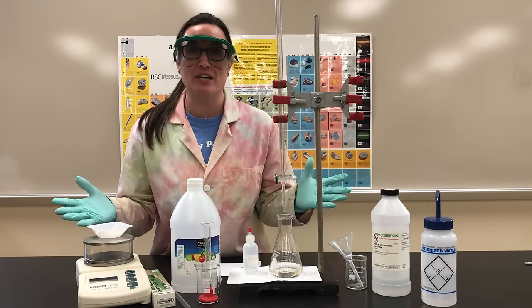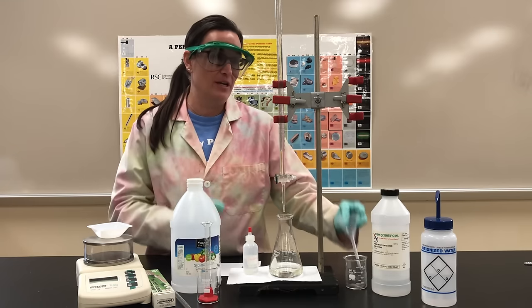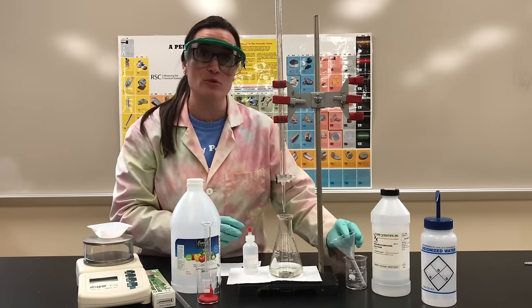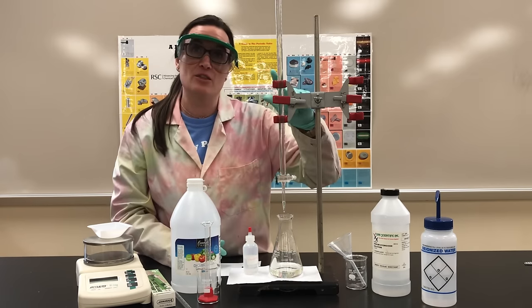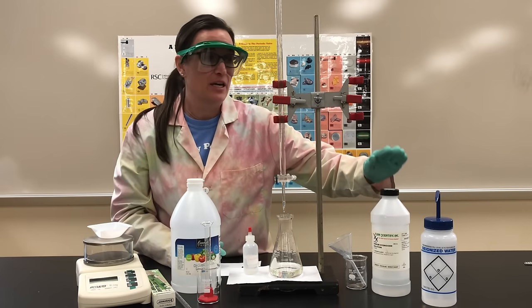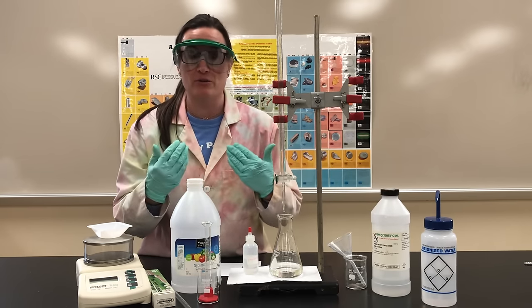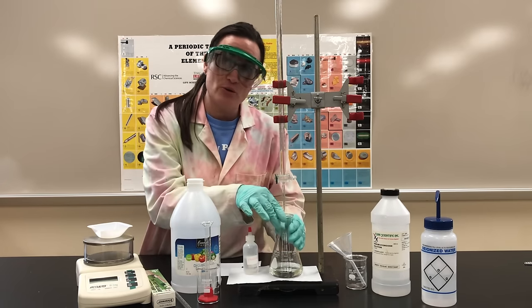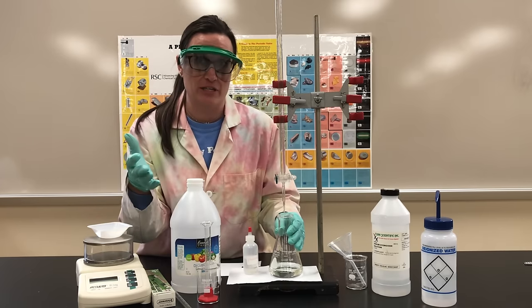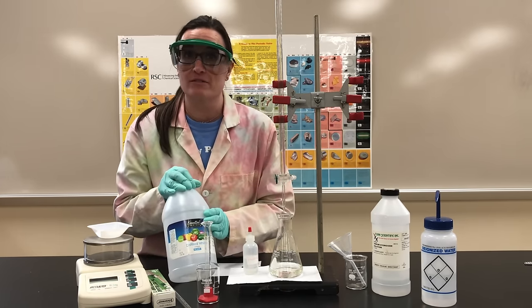Before I show you how to do a titration, let's go through a few things first. Number one, if you cleaned and filled your burette using a funnel, make sure you remove that and put it aside. In the burette goes the standard solution, or the one you're standardizing. It's called the titrant. For mine, it's sodium hydroxide that I know the concentration of. In the Erlenmeyer flask goes the solution you're testing or the solid you're testing. For mine, I'm going to try to find the concentration of acetic acid in vinegar.